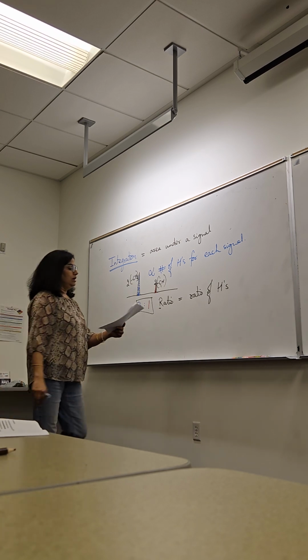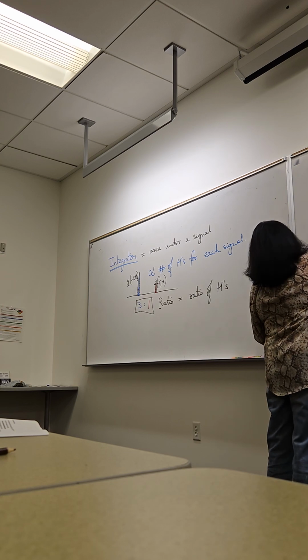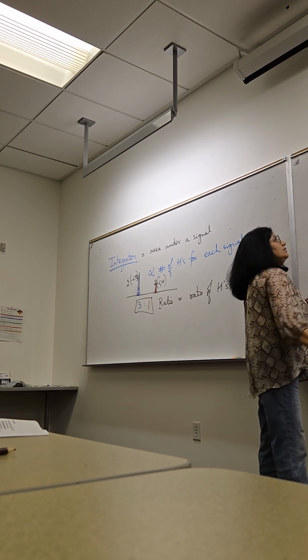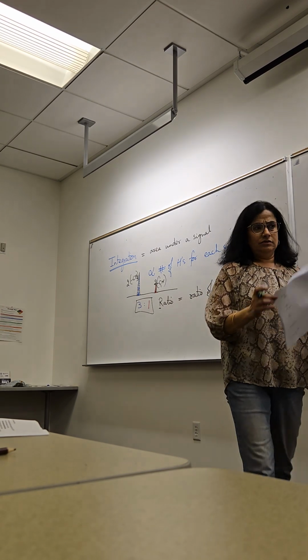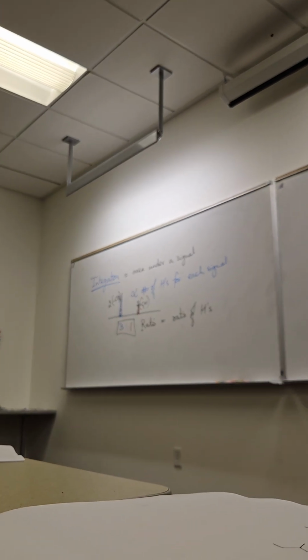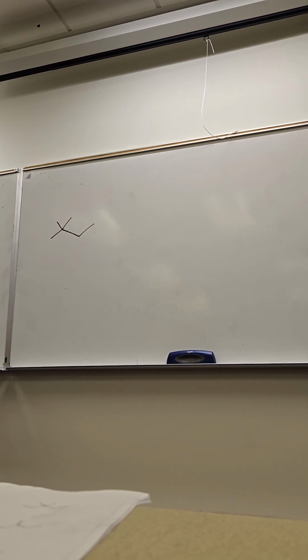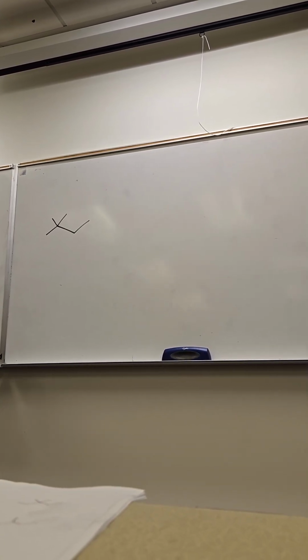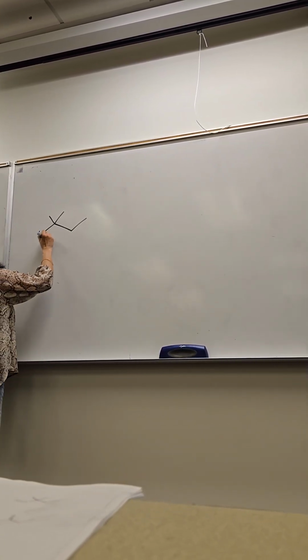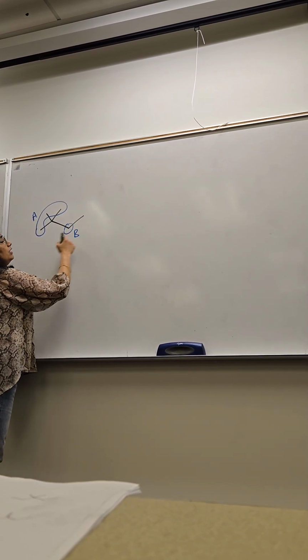So, for example, the first one had only one signal. How many signals did we say this molecule should show us? 3. Which 3 again, just to remind everybody? Do you agree those are identical? These are identical.